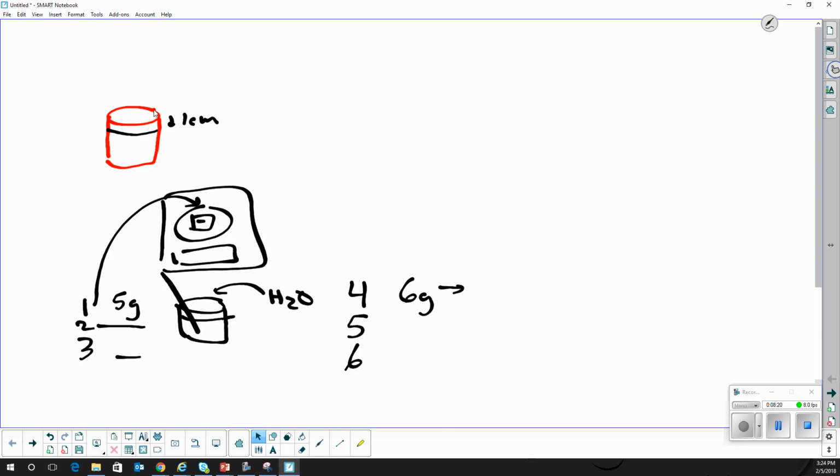And then you're going to figure out the molarity. So you're going to change that to moles. Then you're going to divide it by the 0.1 liters, and you'll get the molarity of that one. Show me the work. Then make it. Then write down in the next table what it looked like, tasted like, smelled like, all that stuff. Again, fine tune it. Well, it was almost there, but not quite. So maybe 7 grams. Do that again. Find the moles, divide by 0.1 liters, find molarity. Again, make it, taste it.